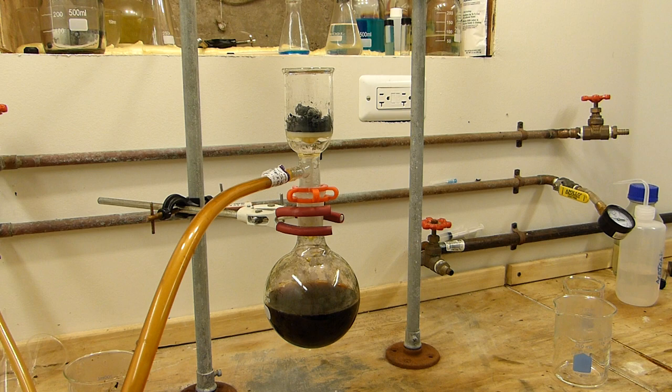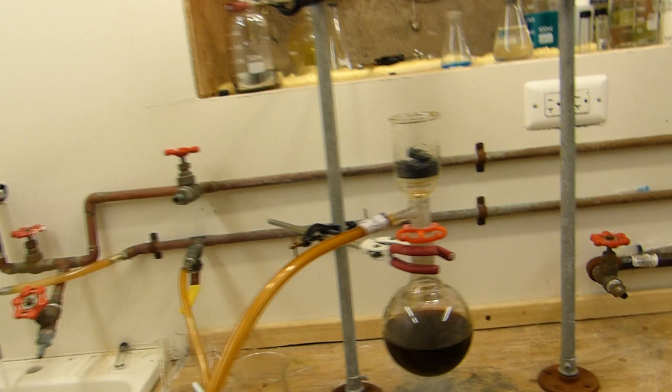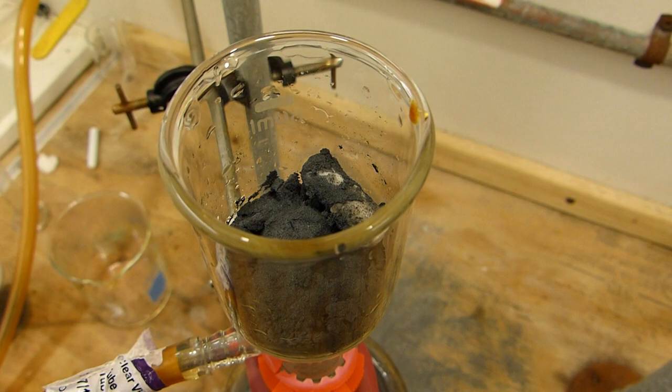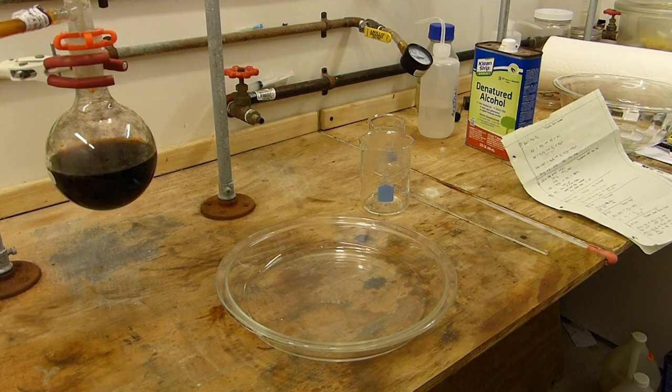Alright and there we go. Our filtration is essentially complete. I'll just leave this on the vacuum for a little while to continue to pull the last remaining bits of water out. And that's what it looks like. We can retrieve the stir bar later.